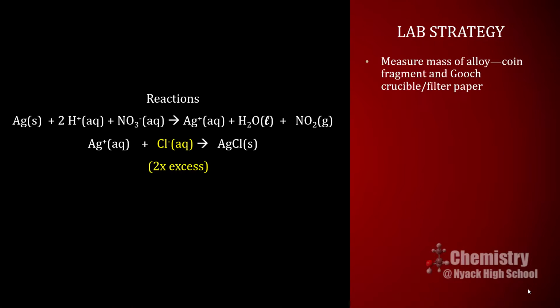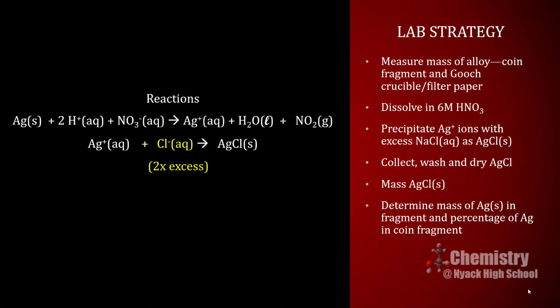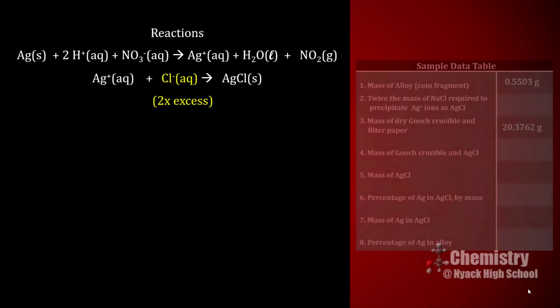And so the lab plan is as follows. We'll measure the mass of the alloy, the coin fragment, and the Gooch crucible and filter paper. We will dissolve it in 6 molar nitric acid. We will precipitate the silver ions with excess sodium chloride solution, and the precipitate will be, of course, silver chloride. We'll collect, wash, and dry the silver chloride. We'll mass it. We'll determine the mass of silver in the fragment and, of course, the percentage of silver in the coin fragment.